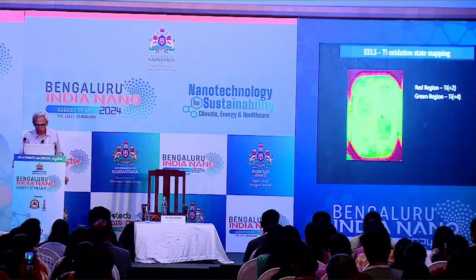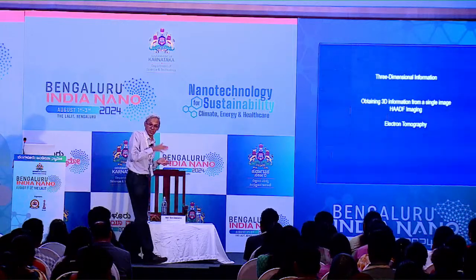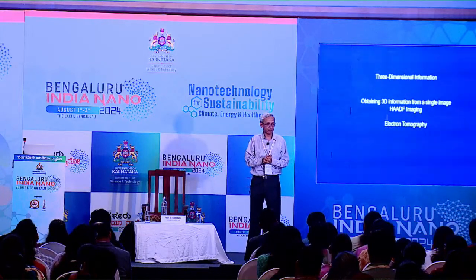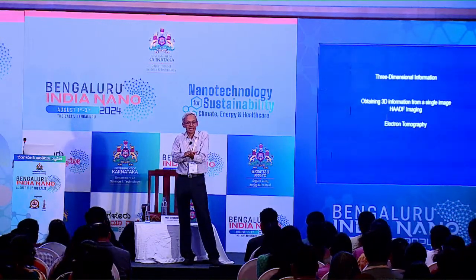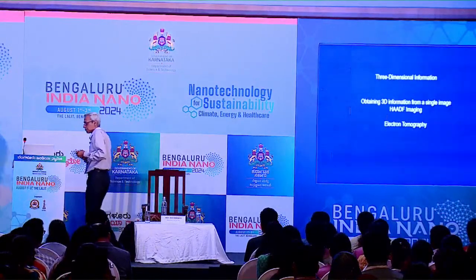Fine. Okay, so coming back to this projection problem, if you have a projection, is it possible to get 3-dimensional information from a material? The ideal situation is that we want to characterize things in 3D, not only in the projected 2-dimensional image. Is it possible to get information in 3 dimensions, and how can we do it?